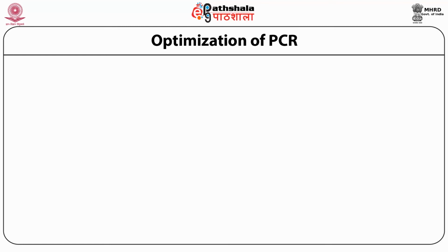In this approach, PCR is carried out in 2 rounds. In the first round of PCR, primers are designed to give a product which must have the target DNA fragment. In the second round, specific primers are used to amplify regions of the target DNA.